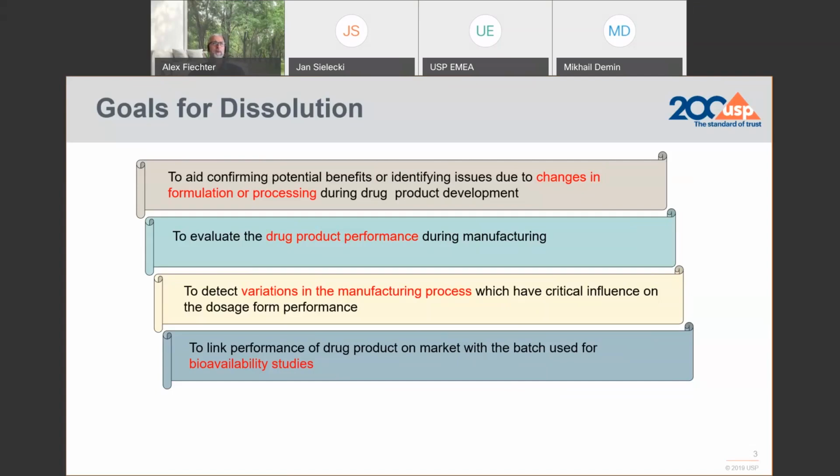But if you also want to assess the drug performance during manufacturing, as an in-process test or a batch release test, dissolution is the ideal quality and qualification test to go for. Variations in the manufacturing process can have critical influences that you would be able to review with the performance of the dosage form used for this particular test.